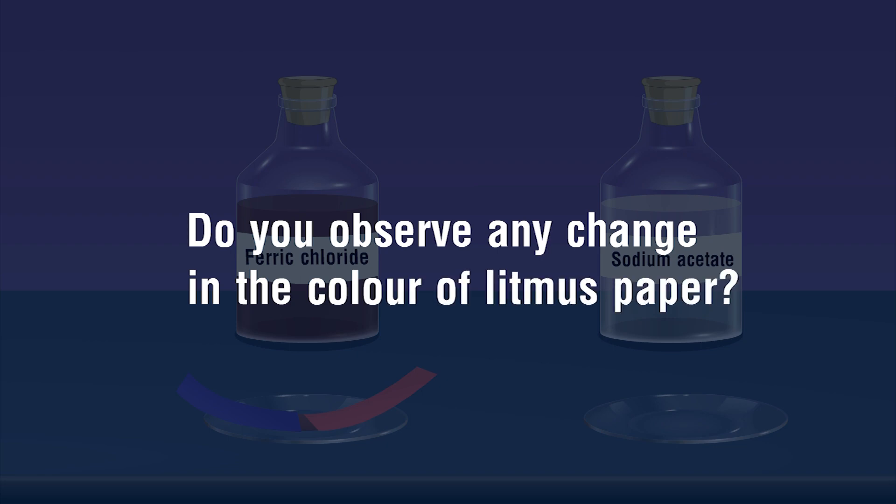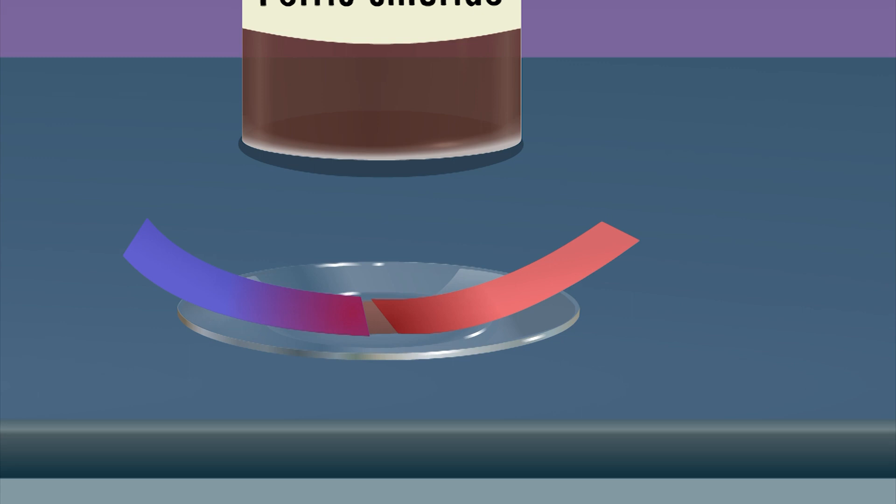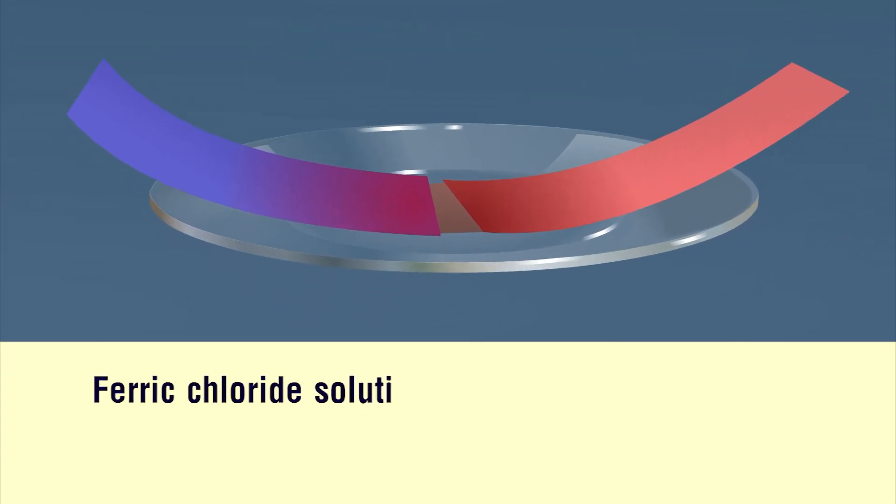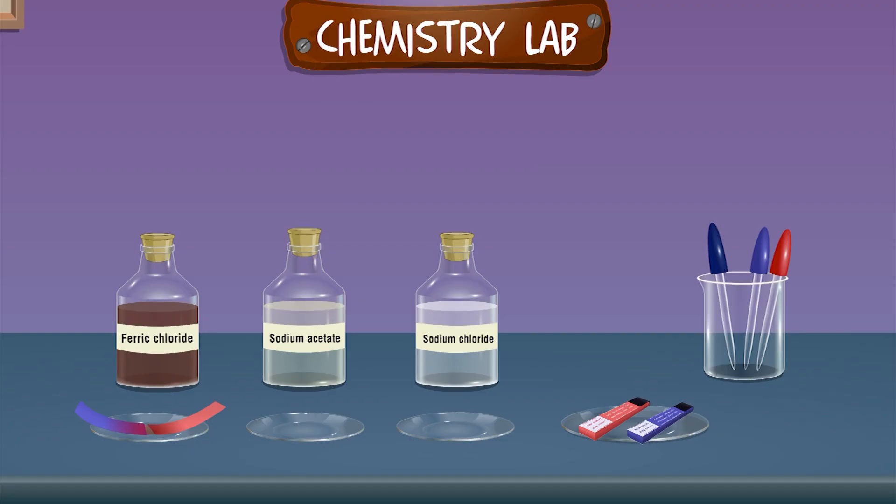Do you observe any change in the color of the litmus paper? Ferric Chloride solution turns blue litmus paper red, but it does not change the color of red litmus paper.